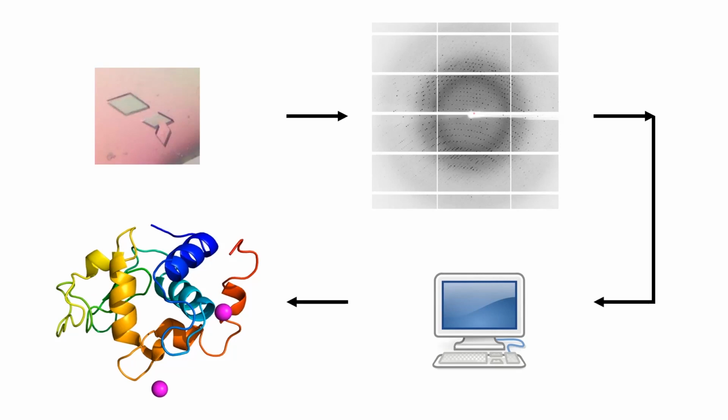Crystallization and derivatization are both laborious processes. To address these bottlenecks, we have devised an optimized screening procedure that simultaneously achieves both of these objectives. This protocol uses a previously developed technique known as Random Microseed Matrix Screening.